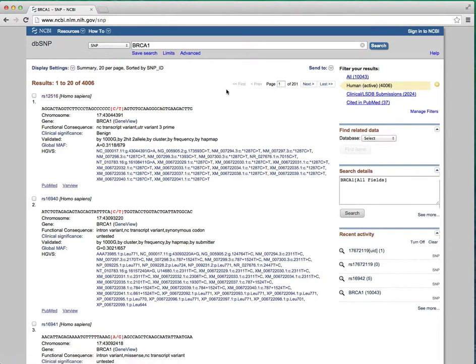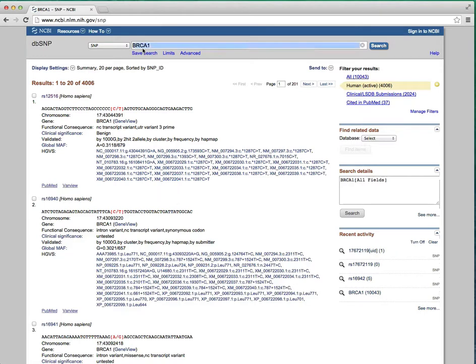All of the entries have RSIDs or RSNumbers. This is quite often the handle you have for a variant, so I'm just going to search for RS16942.